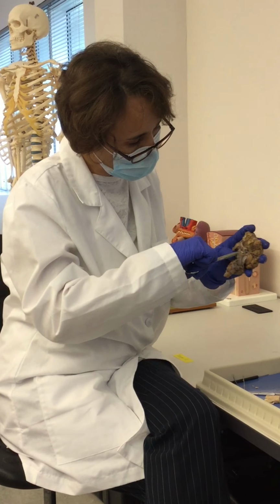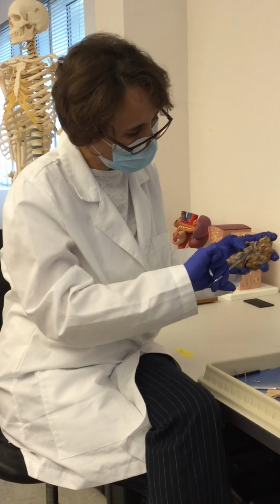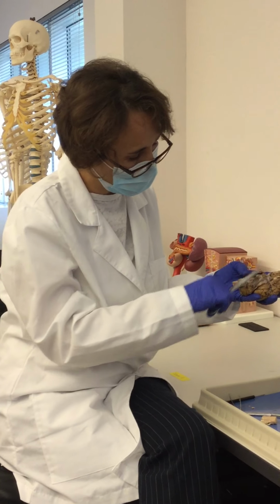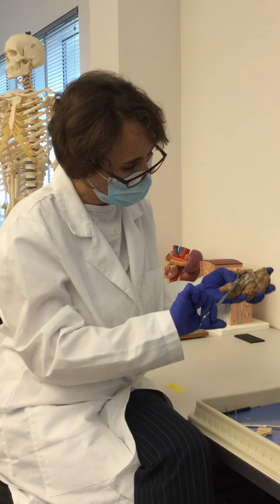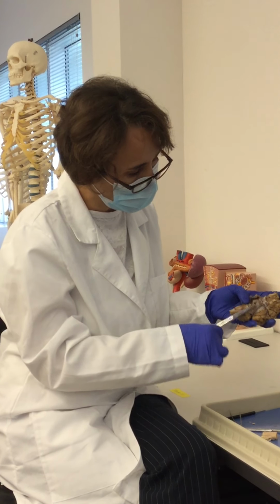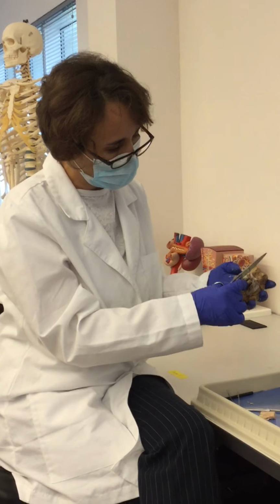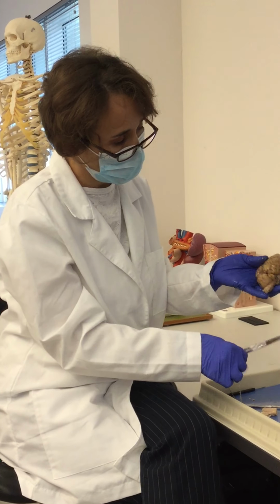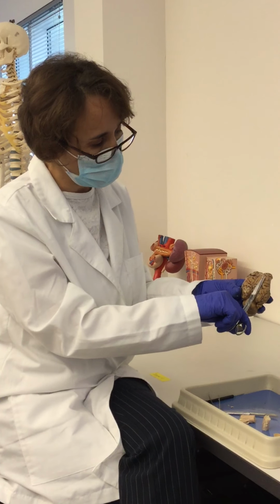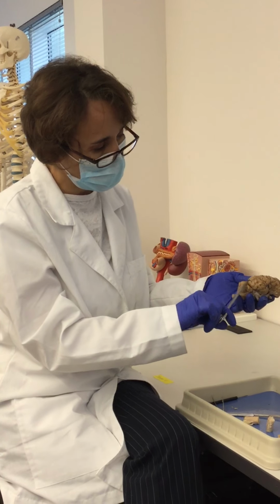Okay, so it's going to be hard to remove from there. I was trying to slide the tip of the scissors underneath and then show you the optic chiasma, but it seems like it's hard, so I will show it to you once I do the mid-sagittal section, which I'm going to do right now.